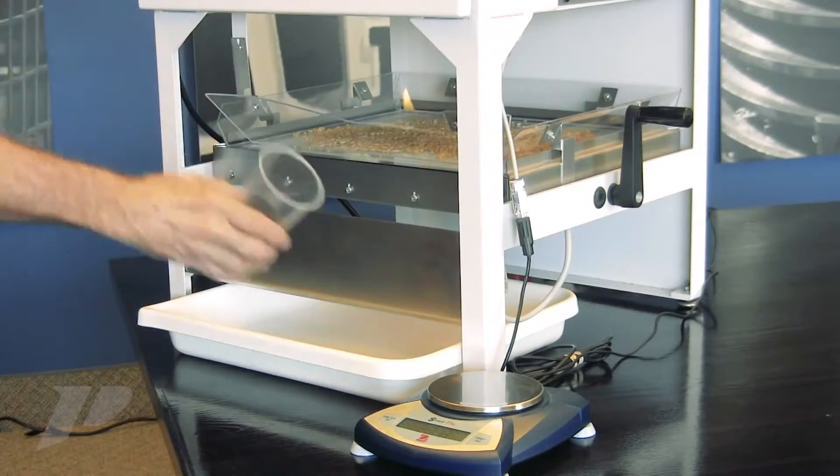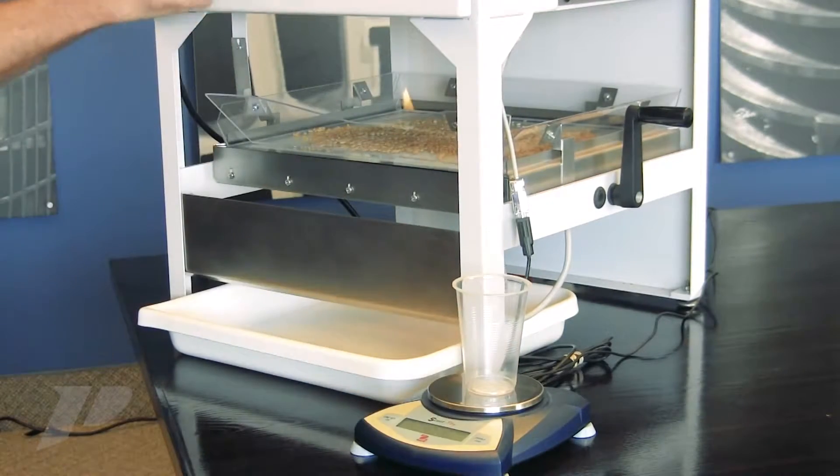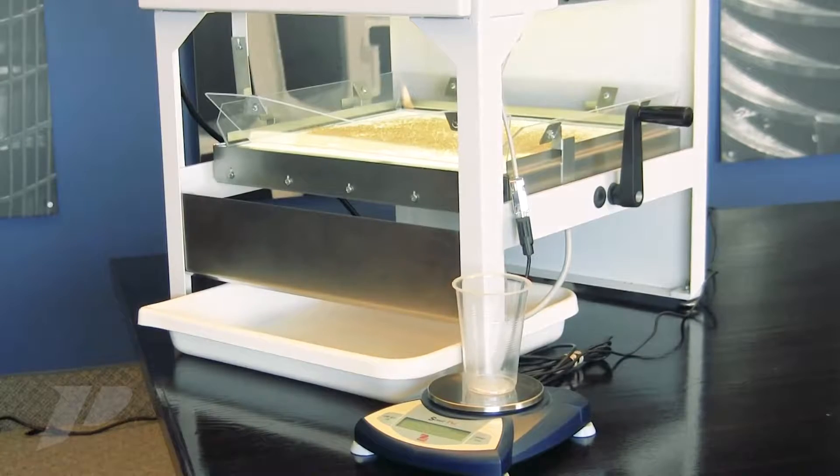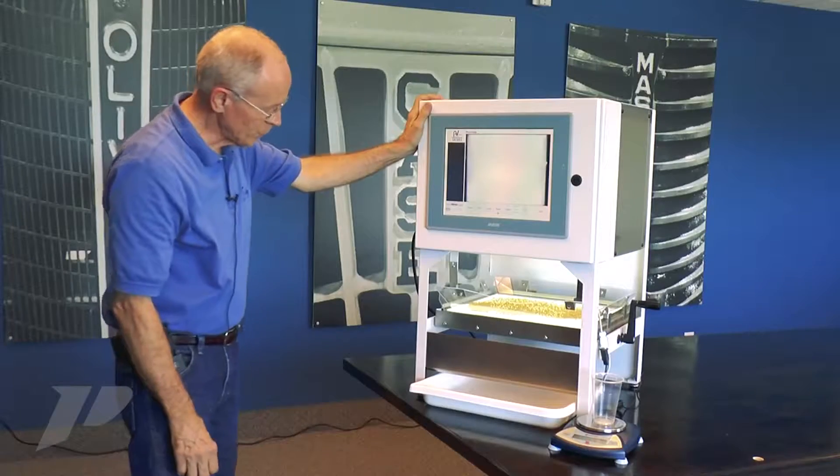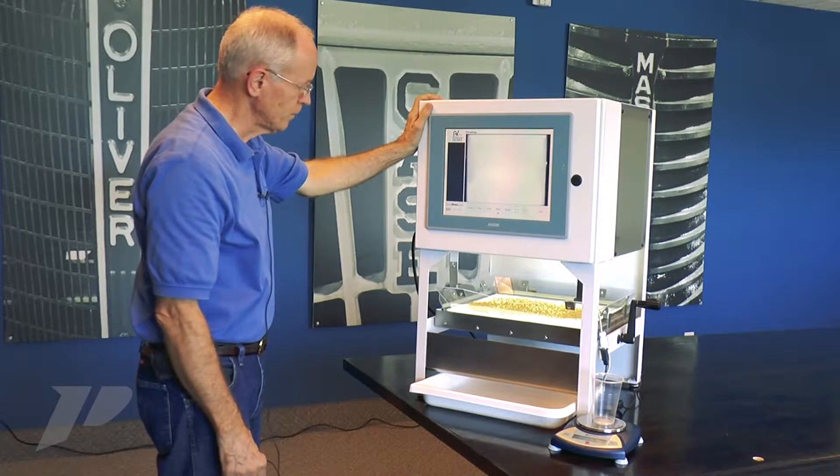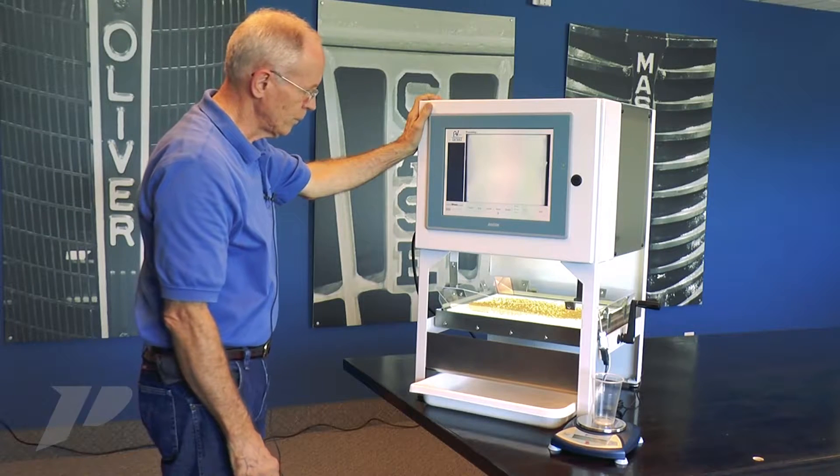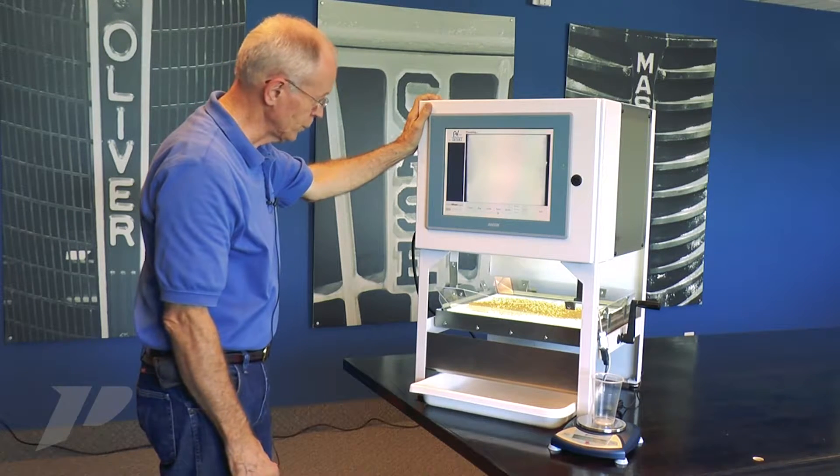When we click next, the stage will vibrate to monolayer the product and spread it out, and we'll take an image and process that image. We're going to count the kernels on the stage.